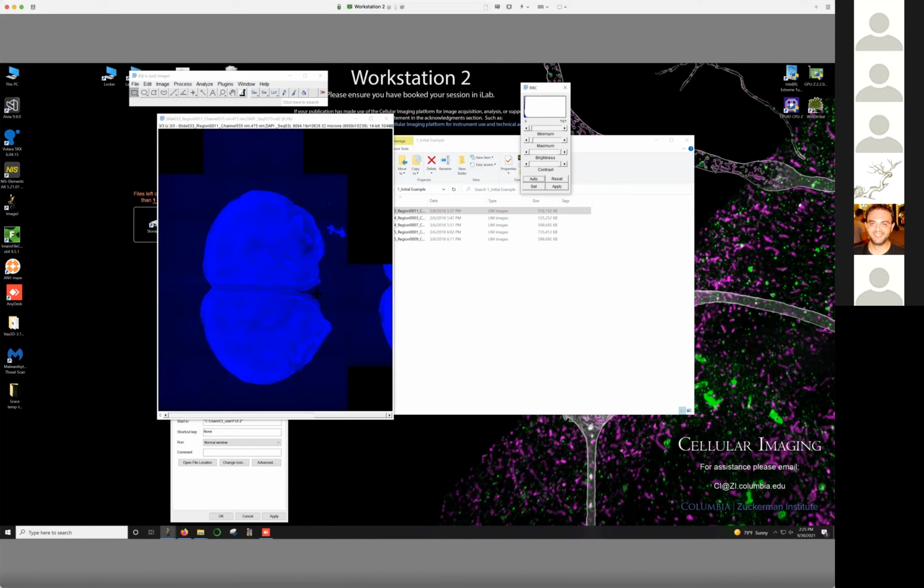So for this background, in case you don't know, in ImageJ you can see the intensity value just here in the status bar. As I'm hovering the cursor, you can see that this is hovering around 200 or so, maybe a little bit higher. And when I go into the brain, it immediately jumps up to 500 and then up into the thousands. So it'll be pretty safe to put in something like 230, and we should get rid of most of the background.